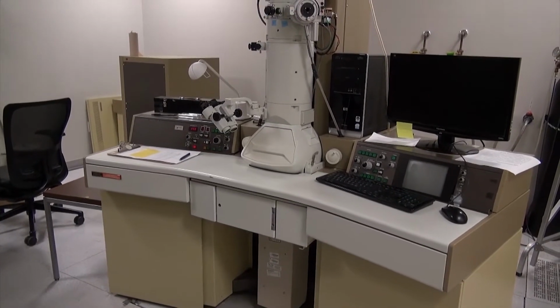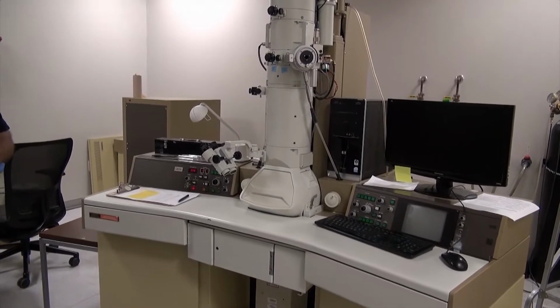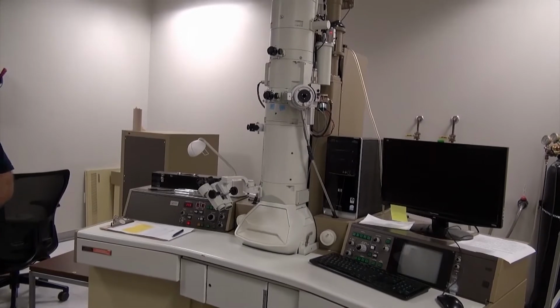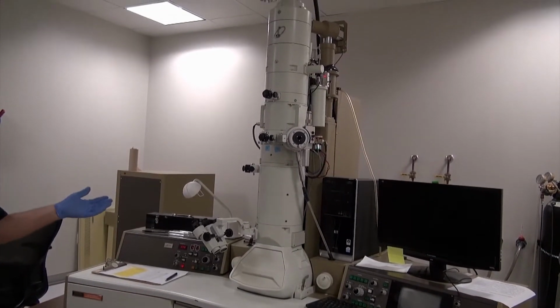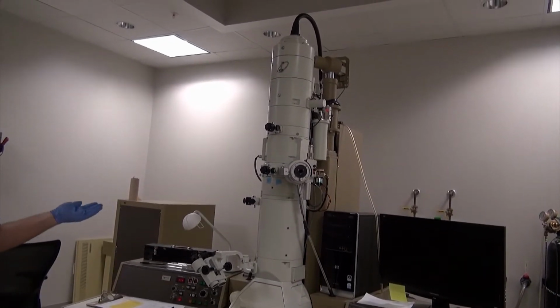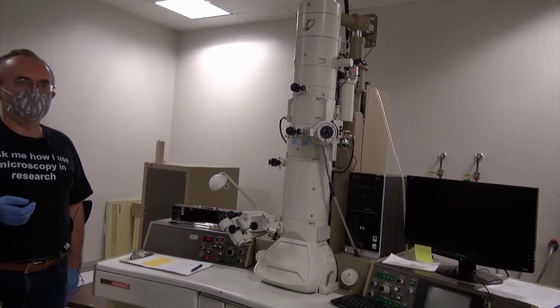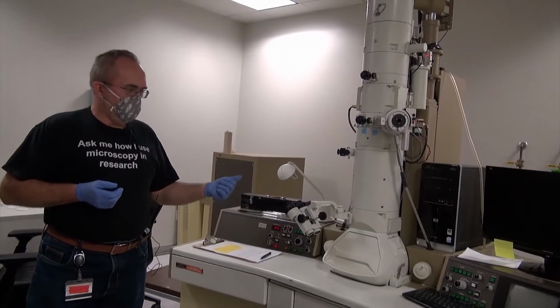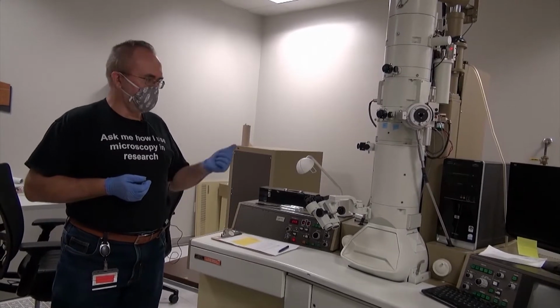So the resolution is less than with the 200 kV instruments, but it provides excellent contrast, which is very valuable for imaging biological samples, whether it's viruses, bacteria, or sections from samples that were fixed, embedded in resin and sectioned. And it's got a tungsten filament. And we have a slow scan 3K by 3K CCD camera for digital imaging.